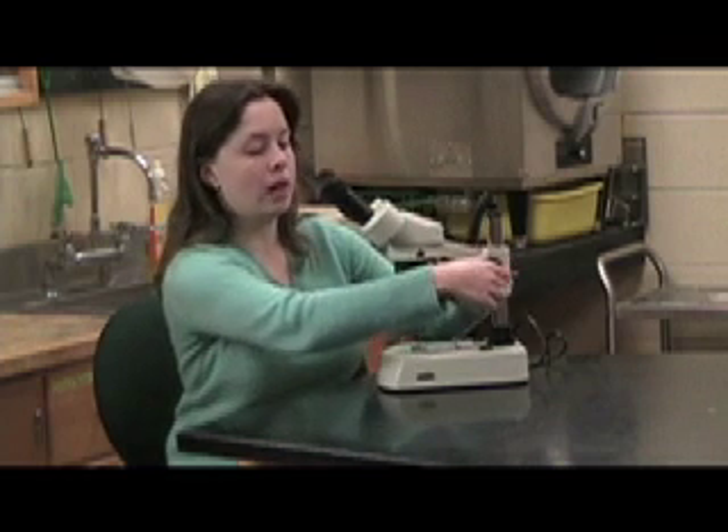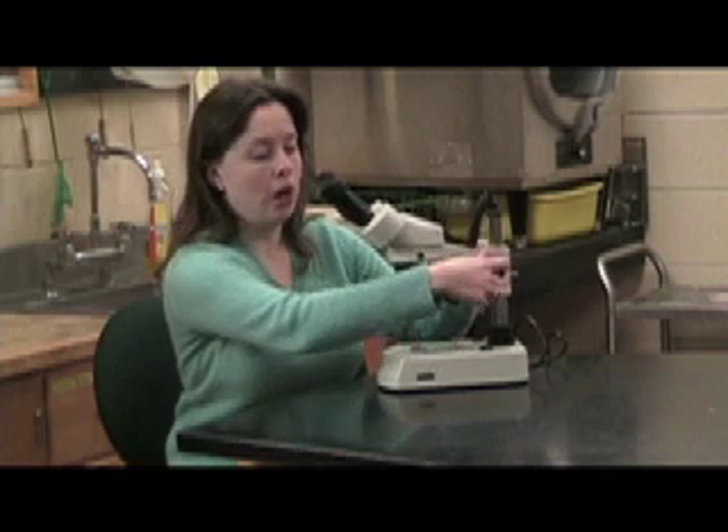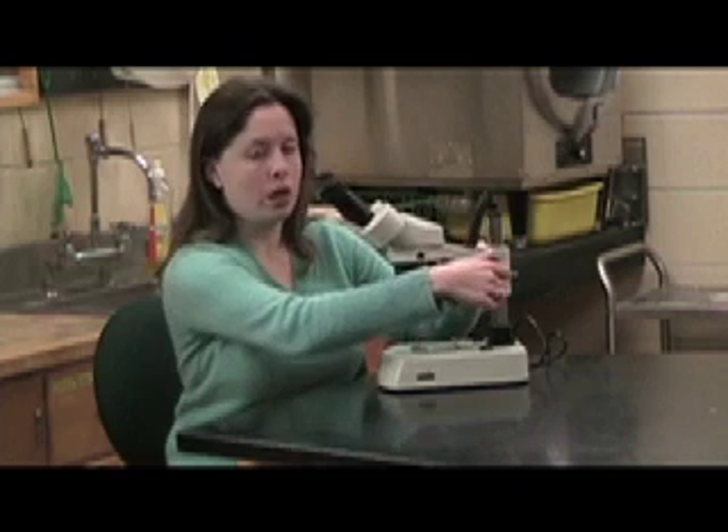To focus, I only have one set of adjustment knobs located on either side here. This allows me to move up and down and focus on my specimen.